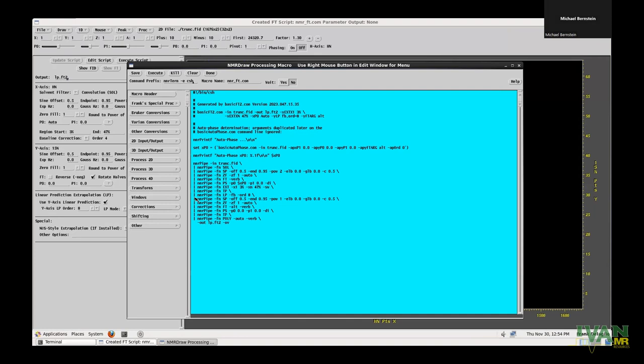Yes. So it is an awesome question, and I will address it here. However many time domain points that you have, you should always at least double them by zero fill. The reason for this is that by convention, even though we measure complex data, we usually only analyze the real part of the result, right? If we don't zero fill the data at least once, we're losing half of the signal that we measured. When you zero fill, that redundantly mixes all of the real and imaginary time domain points that you measured, so that the resulting real part of the spectrum contains all of the information that was in the real and imaginary part of the time domain data.